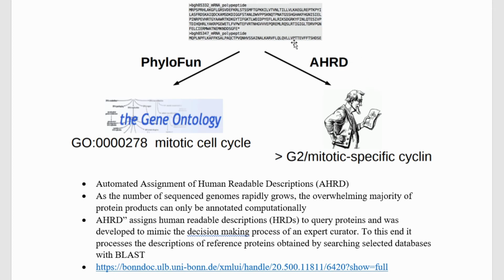So what actually happens is it does all these BLASTs. It scans through a BLAST table. It finds all of the common names for a particular gene. It's sort of like what we did in Actin, where I had you look at what the different names were coming up as. Some names aren't useful, like hypothetical protein or unknown protein or putative protein.